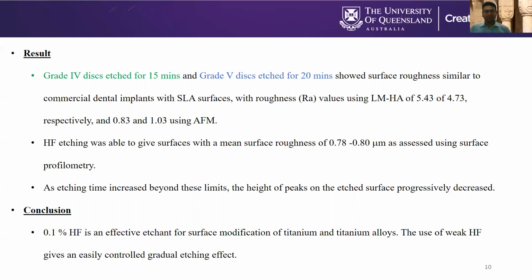The surface roughness can also be measured using a surface profilometer. In this, a small probe that runs on the surface of the titanium gradually records the valleys and the peaks, hence imprinting that on a paper and providing the peaks and valleys as the final result.